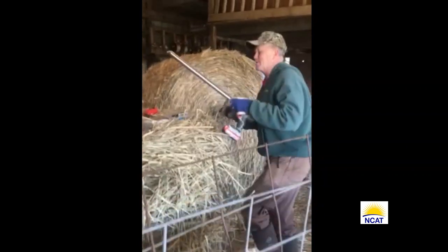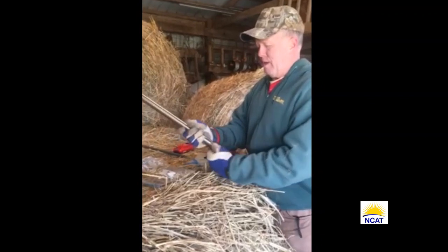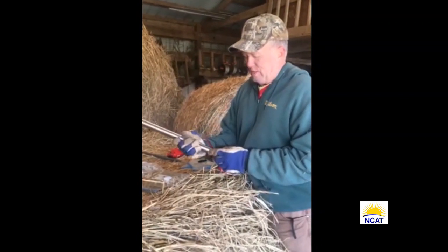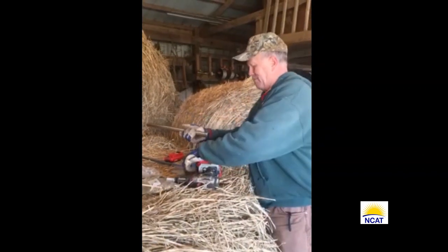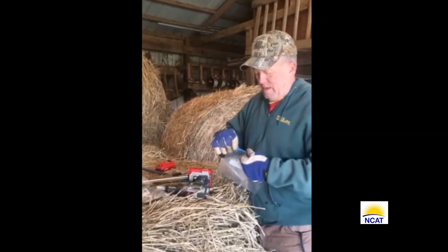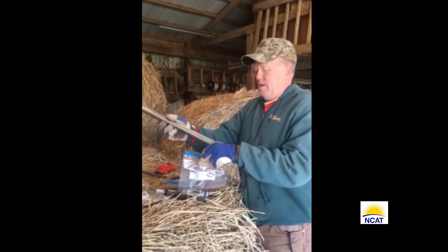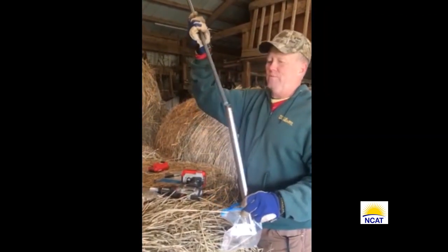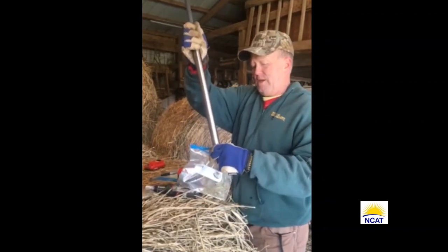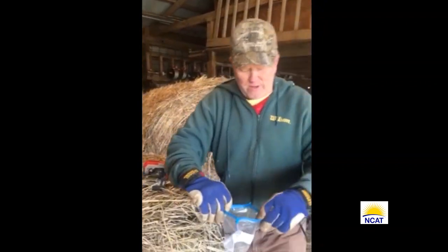So that's the sample I'm going to get. When I'm done, these bits are made where you can pop the end off and just put it in some type of labeled bag. And these come with a plunger so you can just push your sample out and you get a nice cross section of your hay.